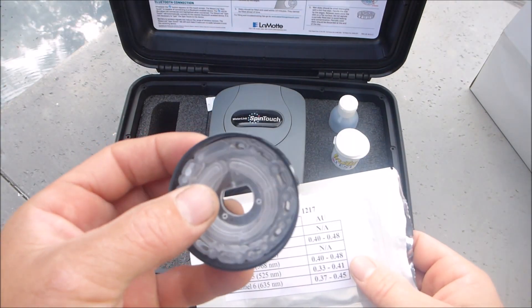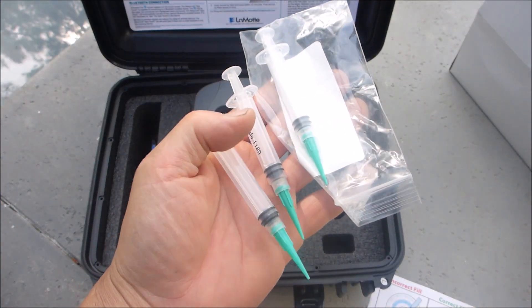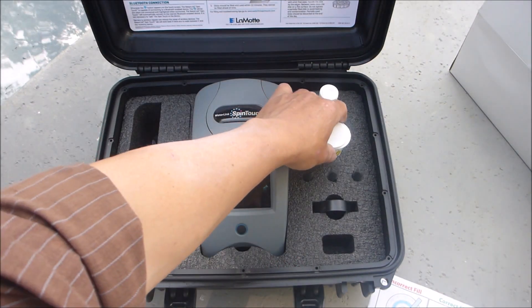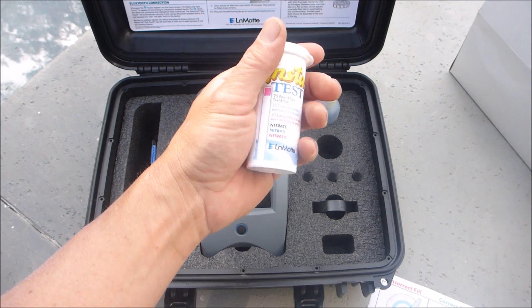It comes with a meter check disc if you have any problems with the calibration of the unit. It also comes with three syringes for the water sample. Just about the only test that the Spintouch won't do is the nitrate test, so it comes with nitrate test strips.